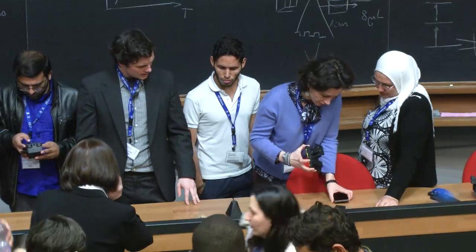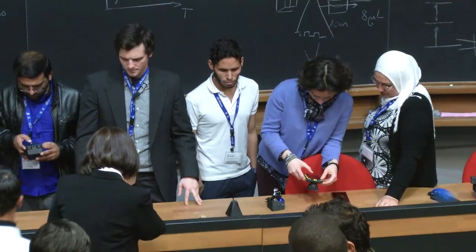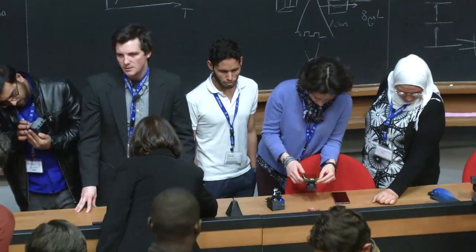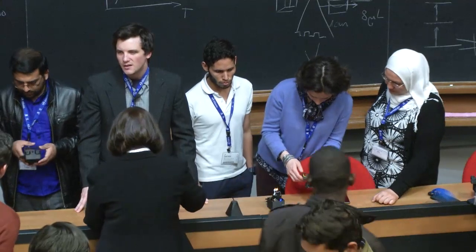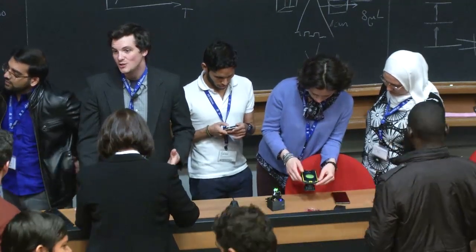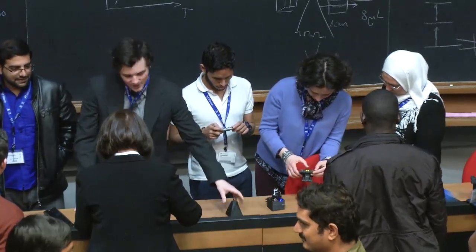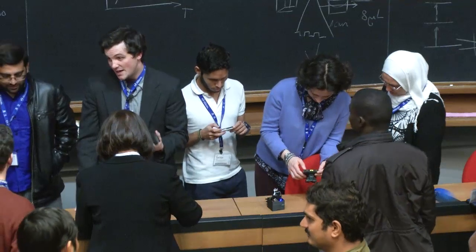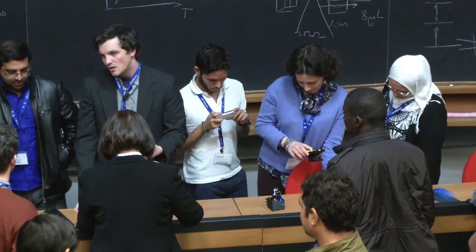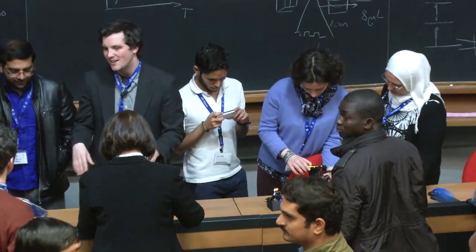No, we haven't yet. I suppose we could. We're very interested in open source type of work, so that would be a really easy way to do that. The issue is, people could just try a low-cost 3D printer. But the 3D printer that makes all these is a nice one. It's an expensive one. I think it costs like $60,000. We purchased it like 5 years ago, so that price has probably come down a lot.